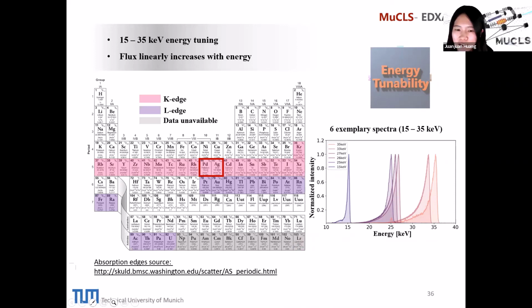So I mean, an X-ray tube is a very mature technique and really easy to use. But in this case, I think the operating difficulty lies in between an X-ray tube and large facilities. Martin also has a lot of experience in operating the machine, so maybe he can share some of his experience.